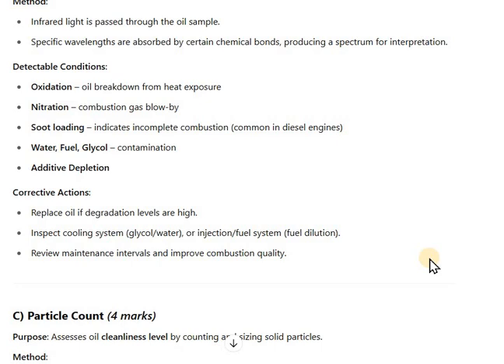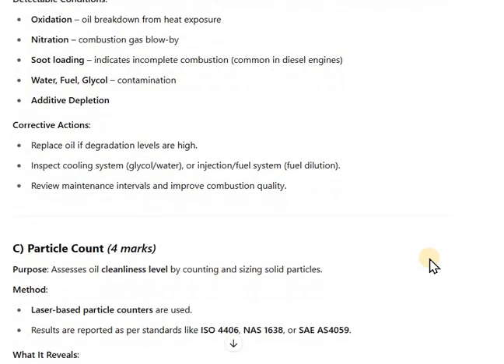Water, fuel, glycol contamination, and additive depletion can also be detected. Corrective actions can be: replace oil if degradation levels are high, inspect the cooling system or fuel injection system, review maintenance intervals, and improve combustion quality.